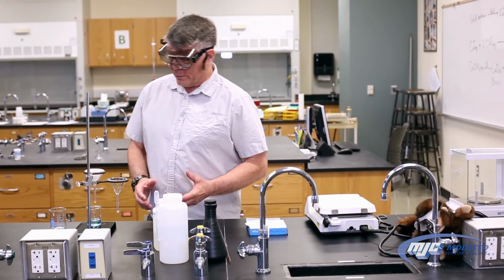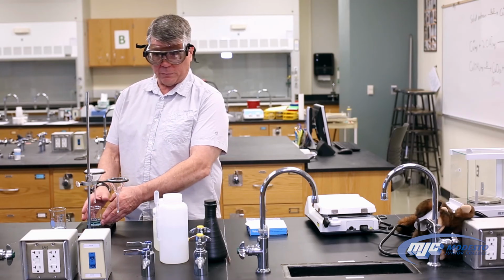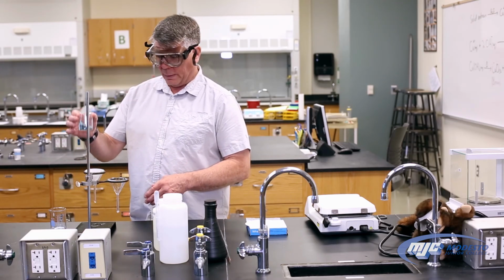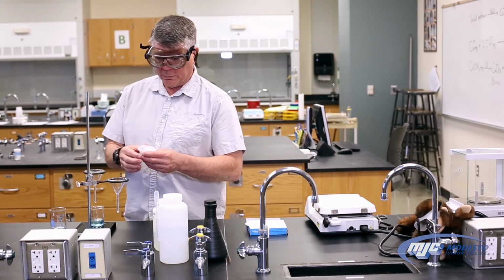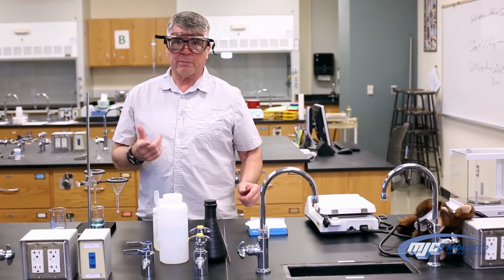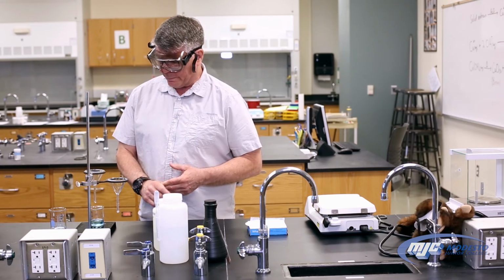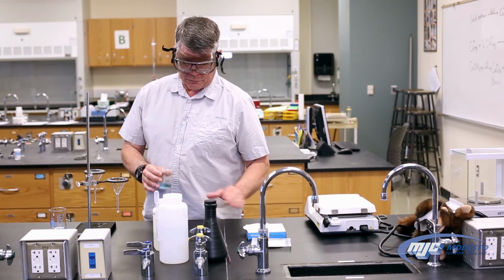All right, guys, now that we've finished the filtration, we've checked to make sure that none of the lead has gotten through. Notice how this is blue. That's where the copper is. All we do with this filter paper here, we've already labeled, we fold it up, and we're going to place that in the oven, let it dry until next week, come back and weigh that. So now all we have left to do is pull the copper out of the remaining solution.